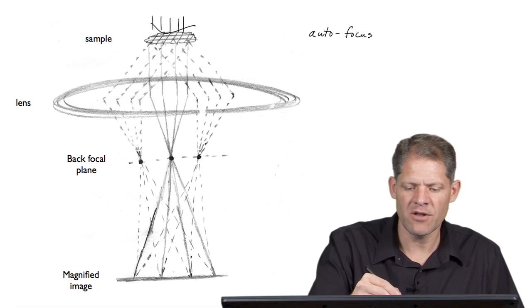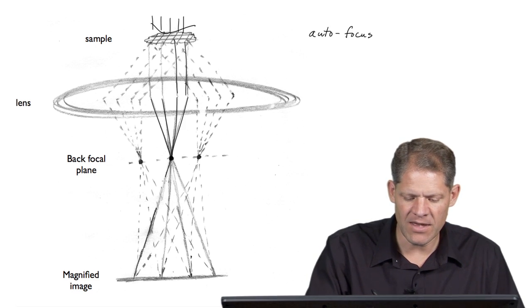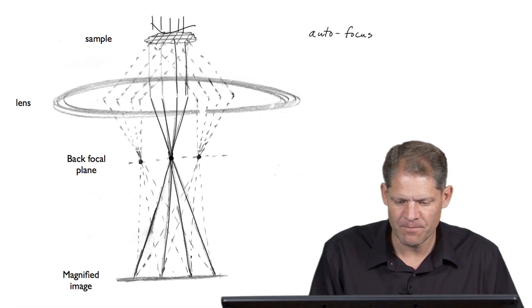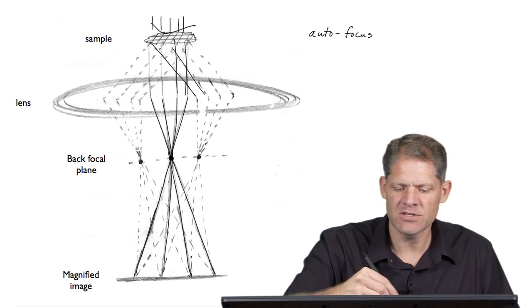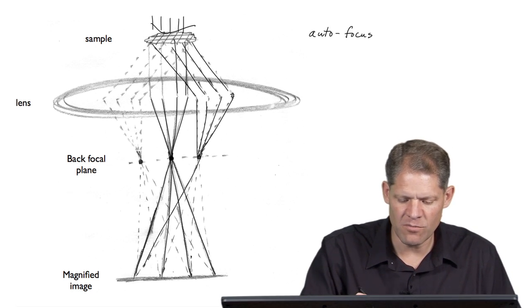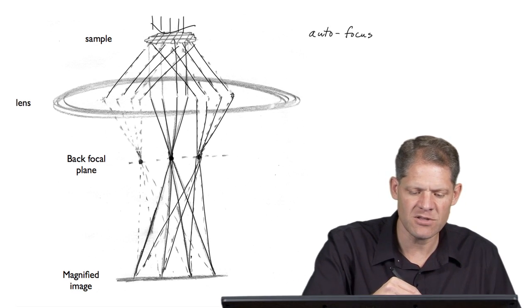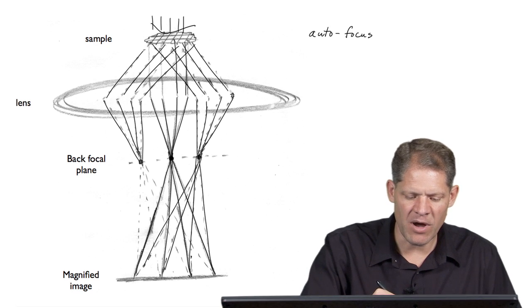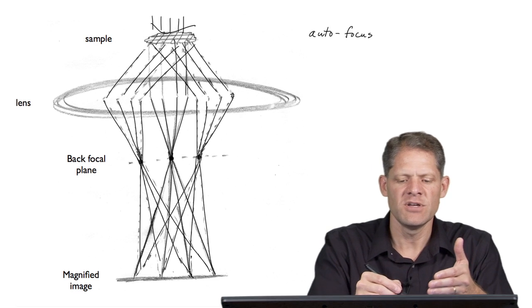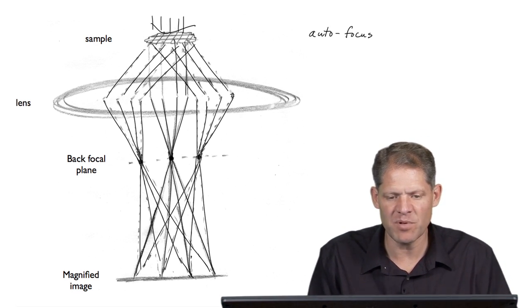And scattering that goes straight on through will be collected onto a particular focus spot here, and then it moves forward through that spot down onto the image plane. And scattering in this direction, say, is focused onto a spot here, and it also moves on through and re-interferes with the unscattered beam. We've been through this before. Scattering to this direction is focused to a spot here, and that moves on to re-interfere. Okay, and so this is the picture of how scattering is refocused by the objective lens to form a magnified image here on the image plane.